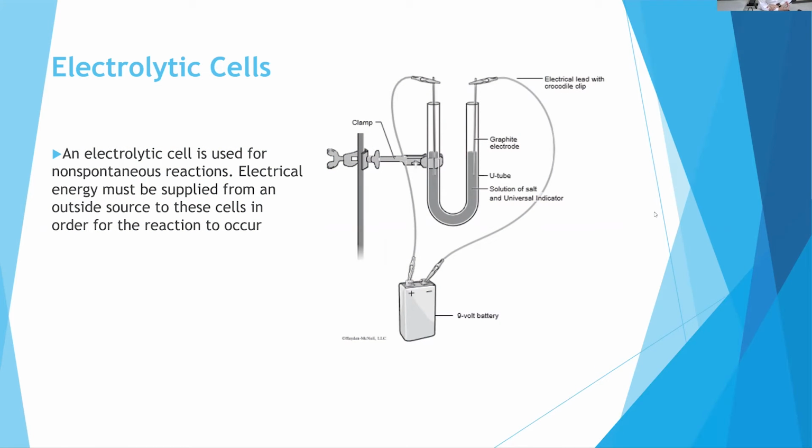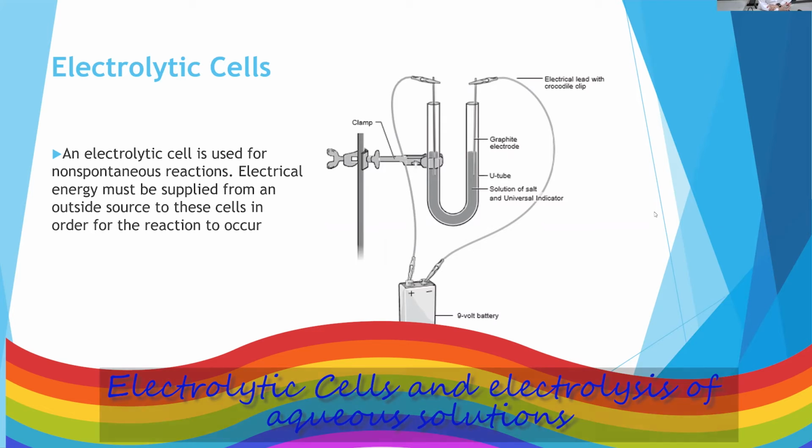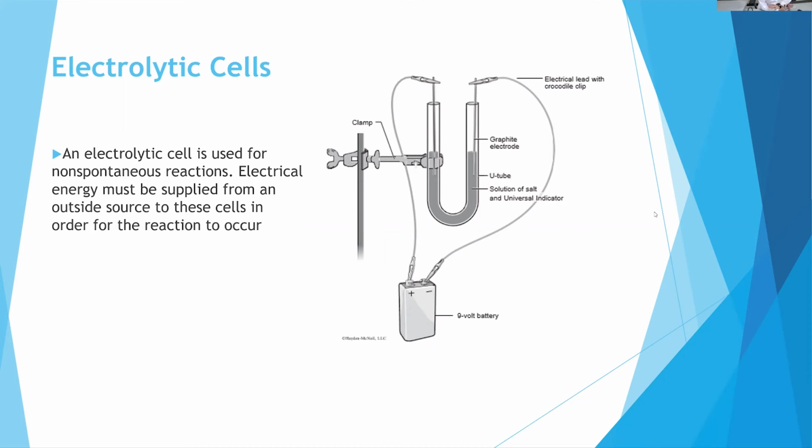Discussions for experiment 7, electrolytic cell. And of course, electrochemistry is a topic involving chemical reactions with electricity. Based on the lab manual, we have a 2-part experiment, but based on the setting of our lab where I did the recording, we are only doing part B of the experiment, which is the electrolytic cell.